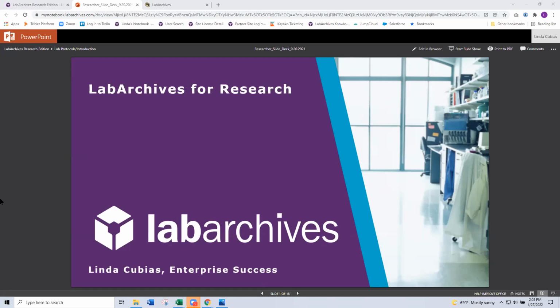So we're going to take about the next hour or so to really introduce you to the notebook, talk about the benefits, and also how you can get started, and give you a feel for how you get your data in the notebook, how you're able to manage it, and use it for collaborative purposes as well. And then also an important aspect of the notebook is access management. As I mentioned earlier, questions, comments along the way, feel free to take yourself off of mute, or you can just type your message into the chat panel.